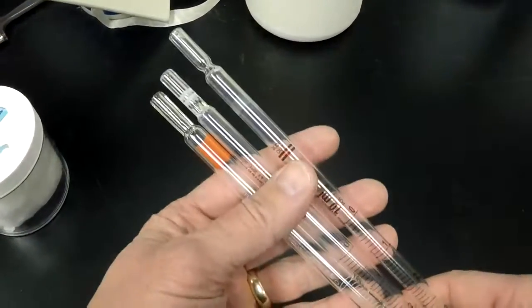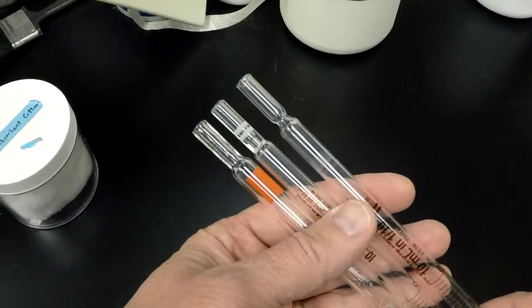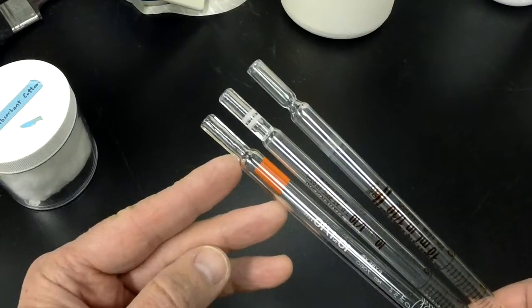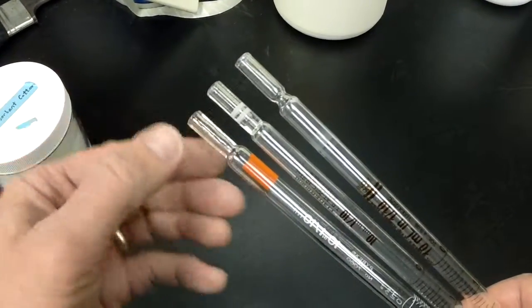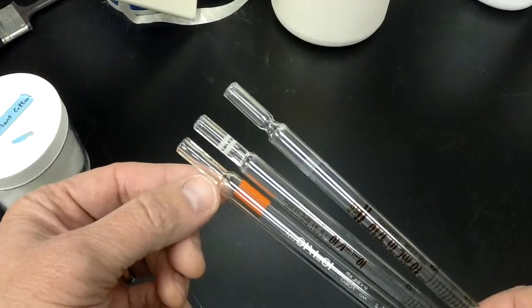First thing to understand is that when you take a look at pipettes, some are actually designed for being stuffed and some are not. The one on the bottom here, you can see it's just straight through, and that's not good because if you try to put cotton inside there, it's going to pass right down through.